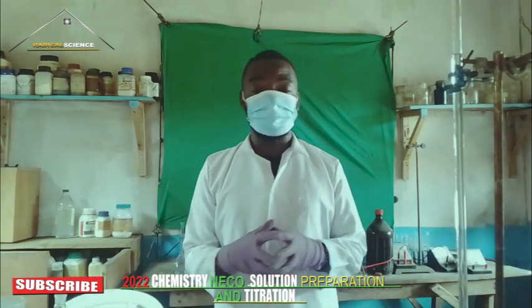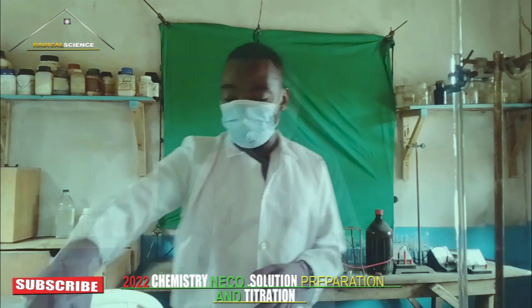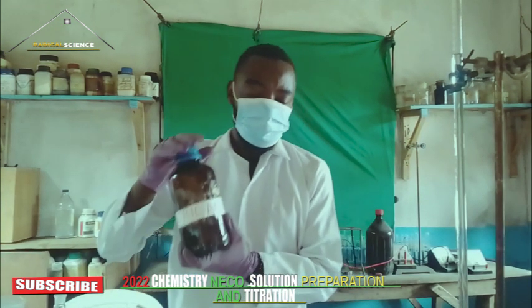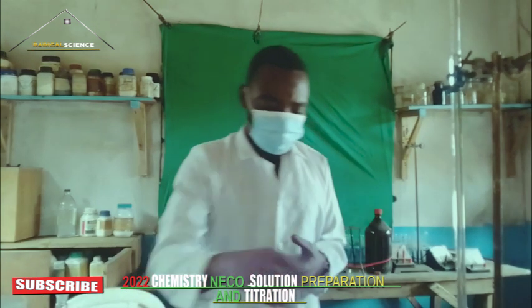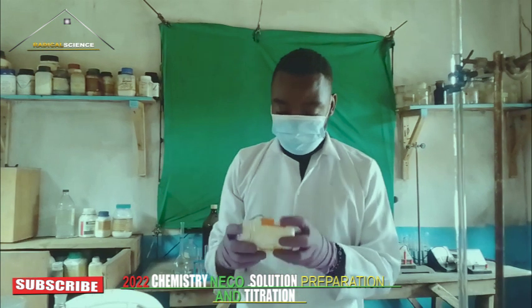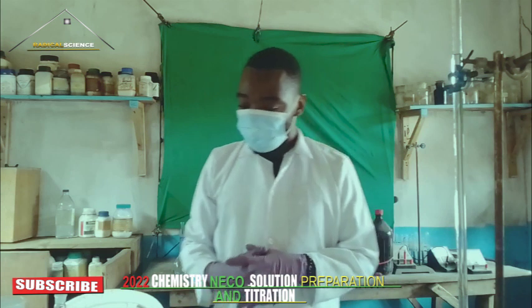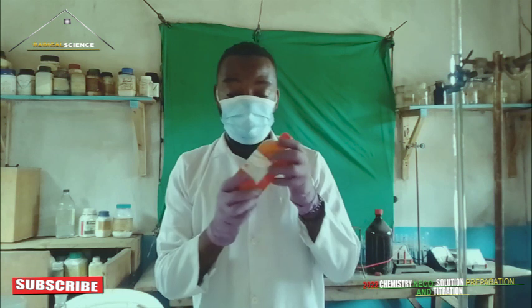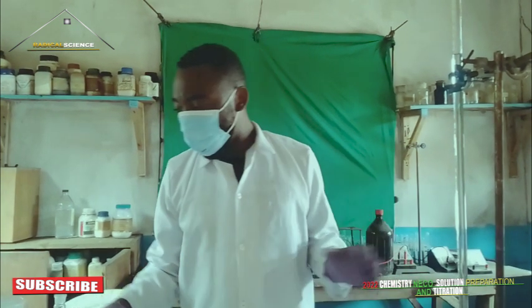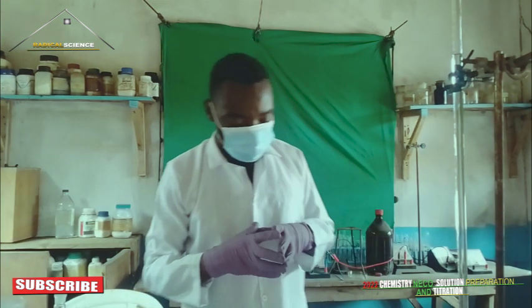Please do not skip this video, because when you skip it you may end up losing one or two steps. Now we have our nitric acid here. These are some of the materials we'll be using to prepare today's practical. This is sodium carbonate, which is sodium trioxocarbonate 4. Here we have our methyl orange as our indicator. Now we have our flask and other materials. Firstly, we need to go through the instruction.